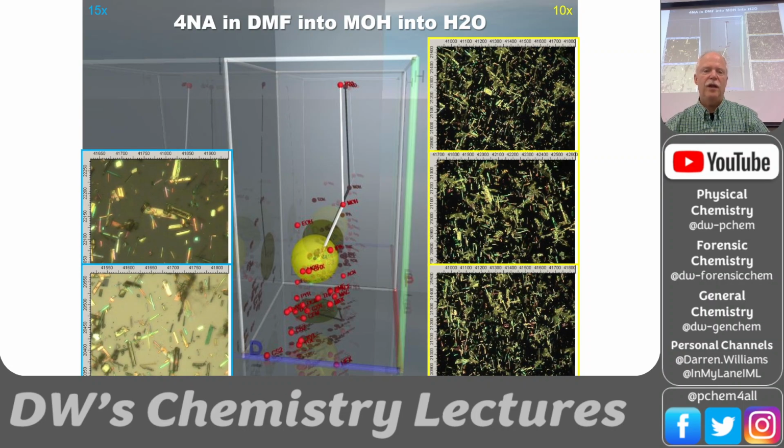Okay, so here's the precipitation path where we went into methanol. So 1 mil of DMF particle solution went into 9 mils of methanol, and then 1 mil of this solution to 9 mils of water, and then it crashed out when we did that. And look at the crystals, they're much more perfect.